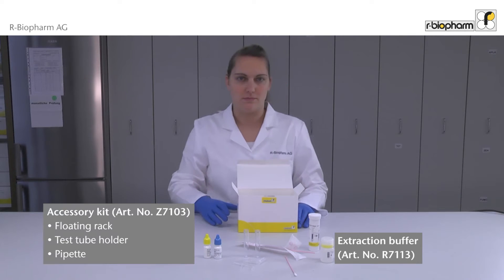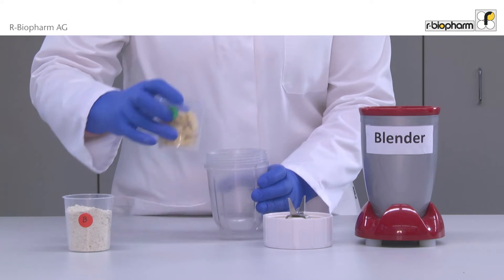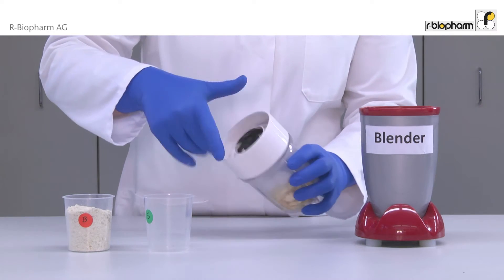It is also recommended to use the accessory kit containing a floating rack. A homogenous sample is a prerequisite, therefore weigh in at least 5g of sample. In case of inhomogenous samples, use a higher weigh-in.